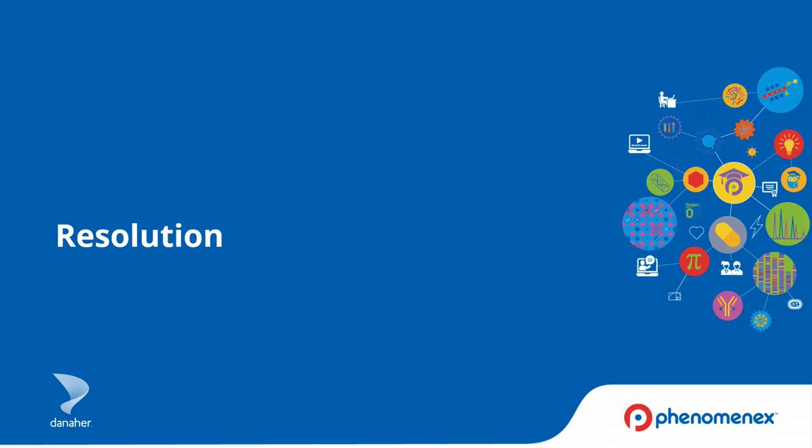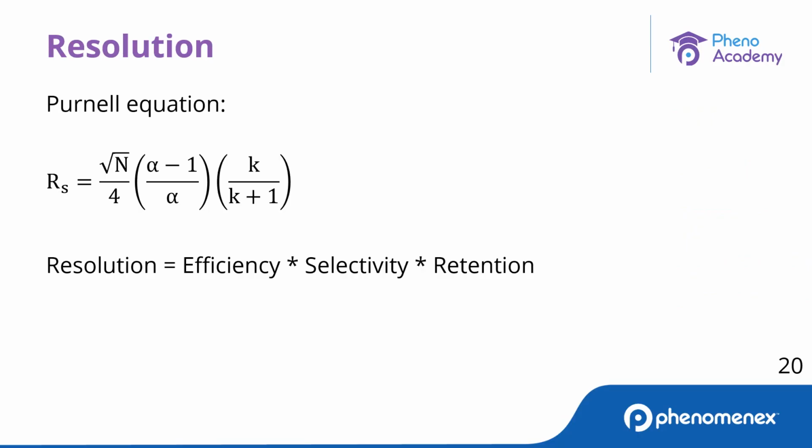Moving on to the final of our 4 separation quality attributes, resolution. Resolution is really where many of the factors that we discussed before come together. So it is described by the Purnell equation, and you can see in the equation that resolution is a combination of efficiency, selectivity, and retention.